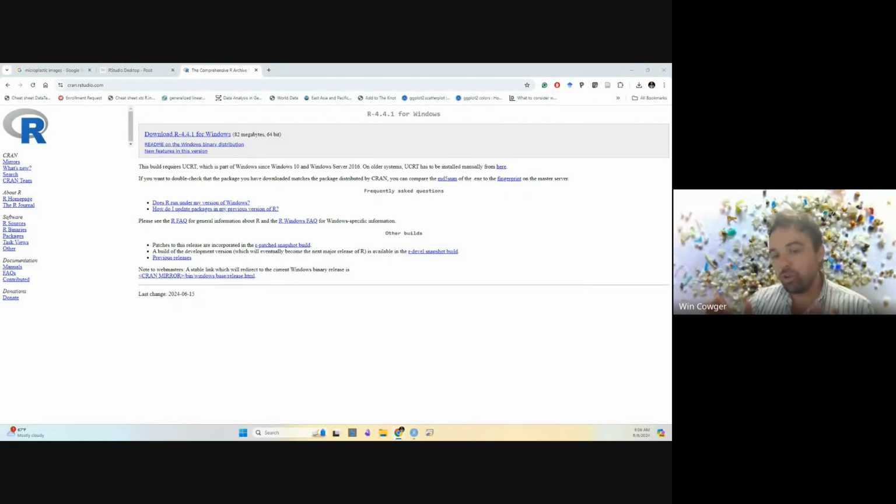You can do some tiny spectral map analysis in Open Specy, but we're actually going to start using the R code console to do a lot of our analysis, because it's really challenging to visualize data sets that are about a gigabyte in size. So we will be using R in future tutorials quite a bit, and I'll be walking you all through how to do that kind of analysis.